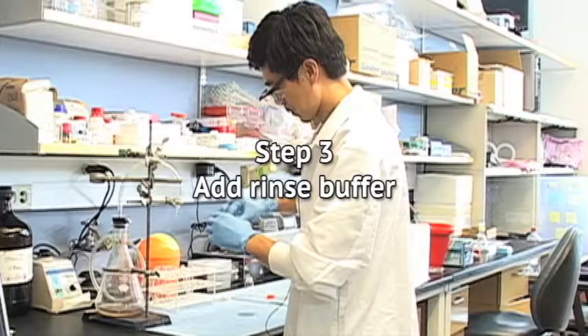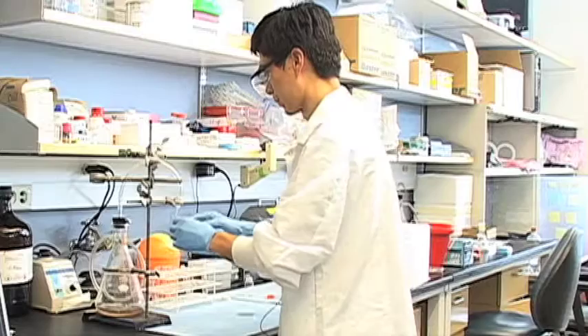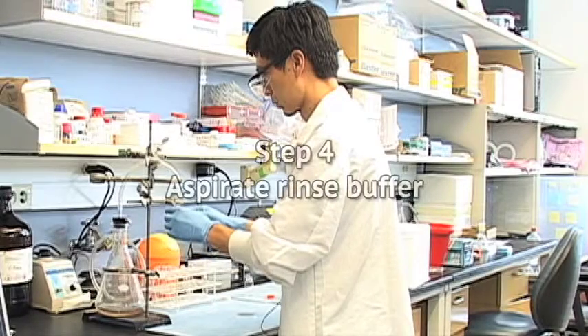Step 3: Add rinse buffer. Gently add rinse buffer to the cell plate. You should use a volume somewhat greater than the volume of media removed from the plate in preparation.